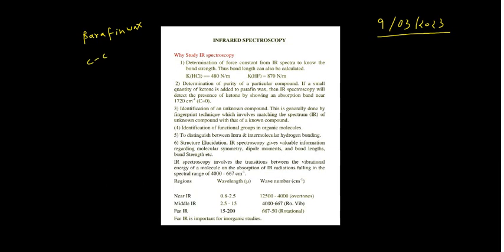That means you have long chains of hydrocarbons, so you have CH3, then CH2, CH2, CH2, and then CH3. For such a compound, if you check the IR spectra, you will find the stretching vibrations of your CH bonds, which resonate between 2900 to 3000 centimeter inverse.